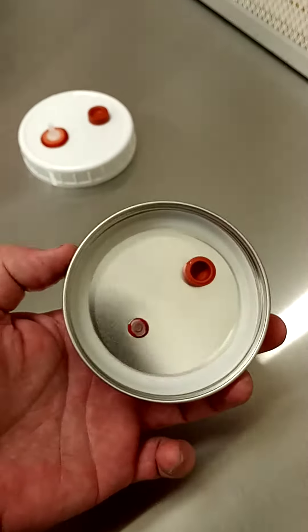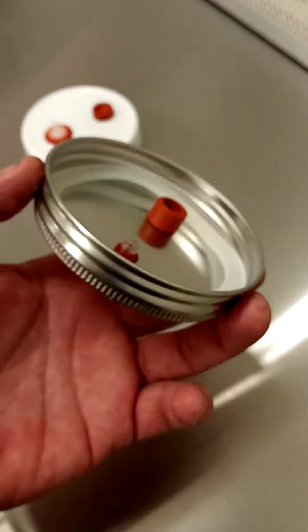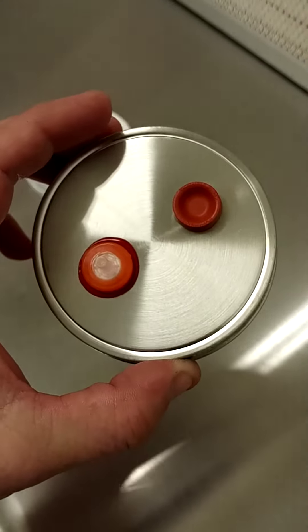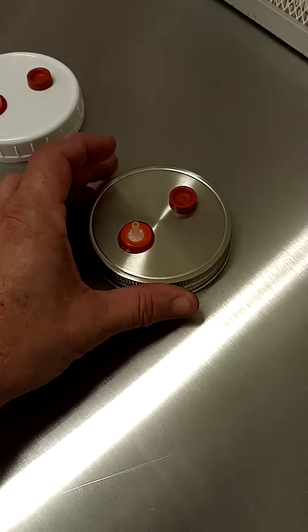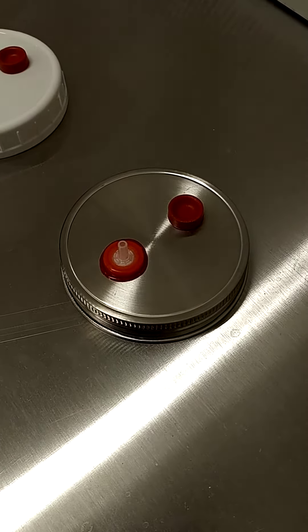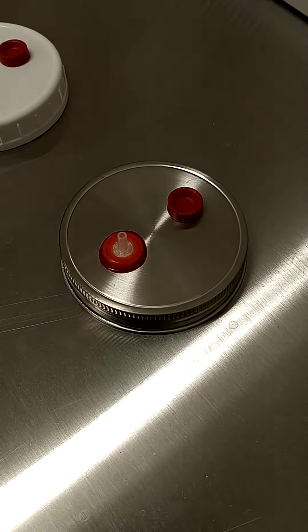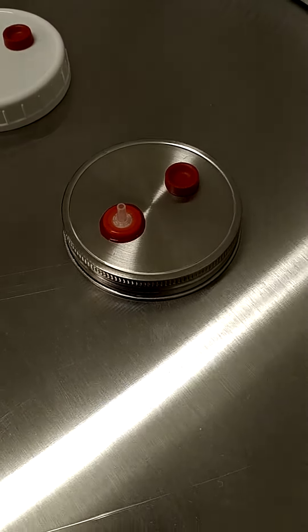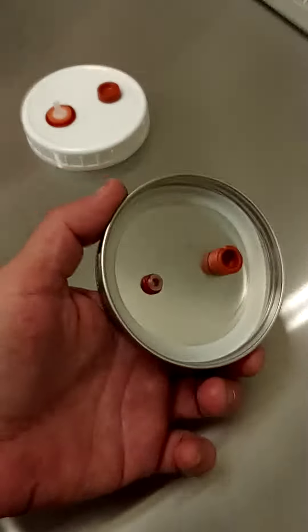We actually had these manufactured and they are surgical 304 stainless steel — they're food grade. They took us a long time to manufacture initially, probably about three or four months to get the first set of them in.